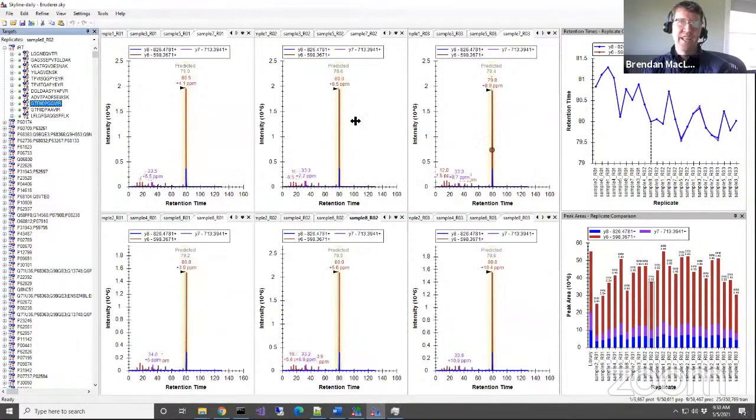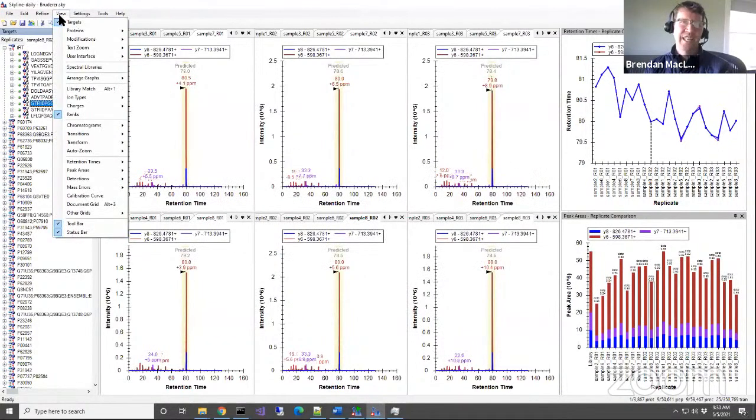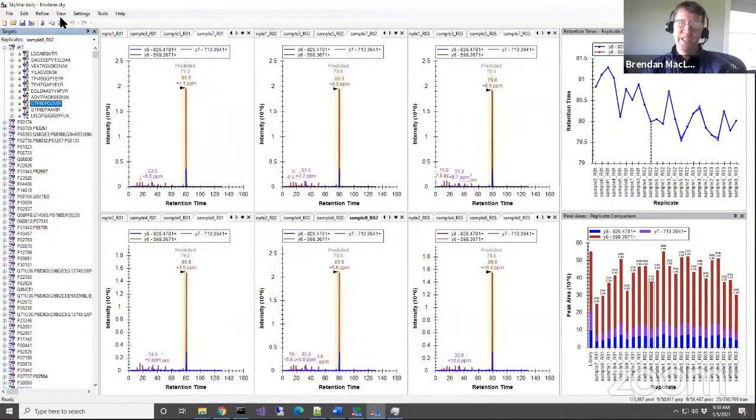Okay, so the last thing I'm going to look at here: there's the question of whether I have to look at every peak. And I said, no, you don't have to look at every peak. We already got MSstats results out of this, and we haven't even looked at anything. So I'm still focusing mostly at the statistical level. I'm showing you histograms, all the statistics. If we went into every peptide and looked at every peak, we would see mispicked peaks.